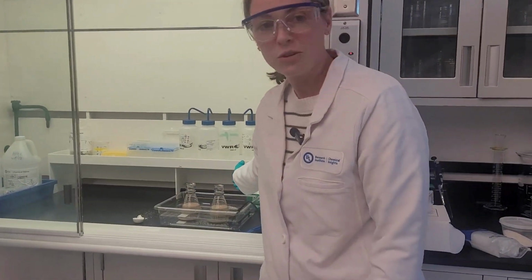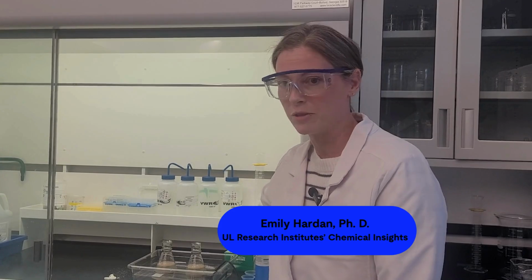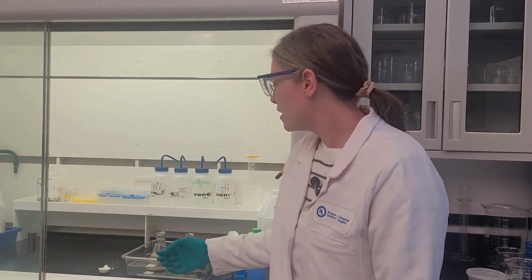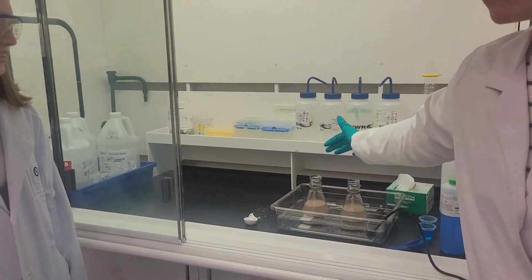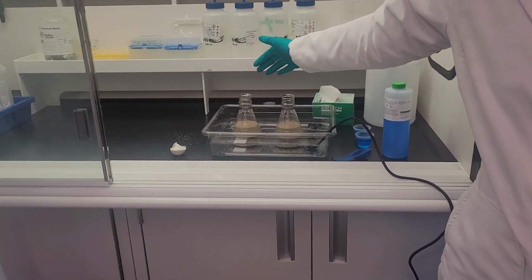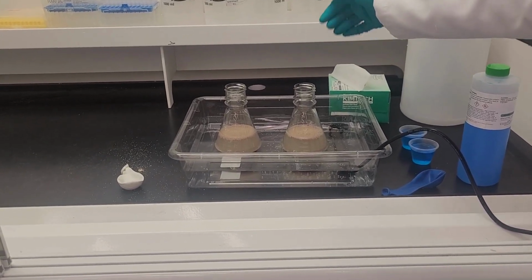Here in flask 2, we're going to add a contaminant, or a toxin, known as copper sulfate. Copper sulfate is similar to what you'd find in vaping. And what we're going to do is compare what happens for flask 1, which is our healthy cells, and flask 2, where we have a toxin similar to what we see in vaping.